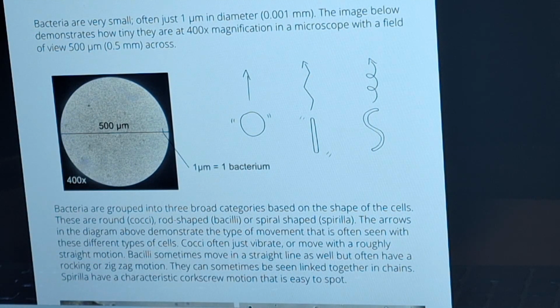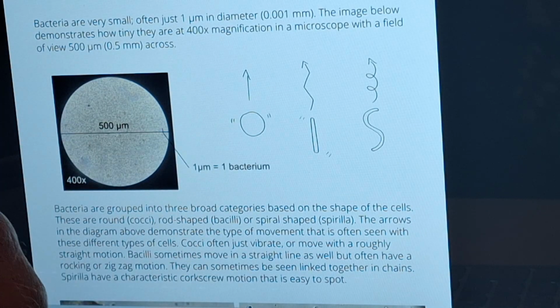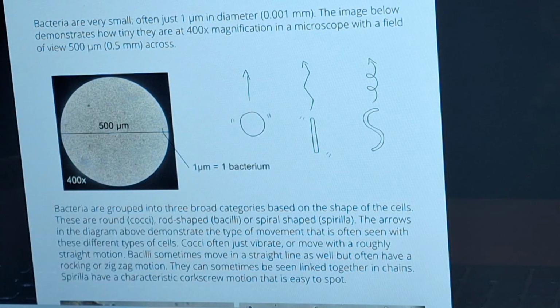All right, so starting from the smallest, we see the bacteria. One reference I've heard is 10,000 bacteria would fit in the head of a needle. Today we'll look at it under 400 magnification, 400x. We'll identify them by their shapes and their motions. There'll be some that are dots, some that are rods, and hopefully we don't see any squiggly ones.